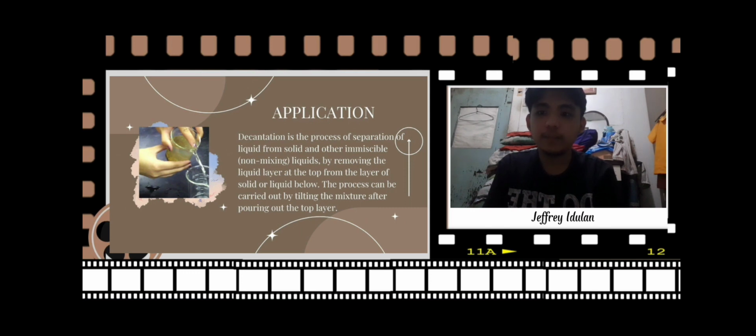Decanting is the process of separation of liquid, solid, and other immiscible non-mixing liquids by removing the liquid layer at the top from the layer of solid or liquid below. The process can be carried out by tilting the mixture after pouring out the top layer. Decantation is used to purify a liquid by separating it from a suspension of insoluble particles. Example, in red wine, where the wine is decanted from the potassium bitartrate crystals to avoid an unsavory taste.